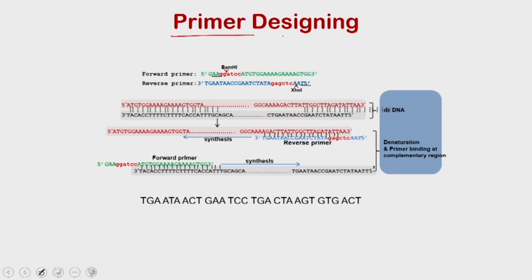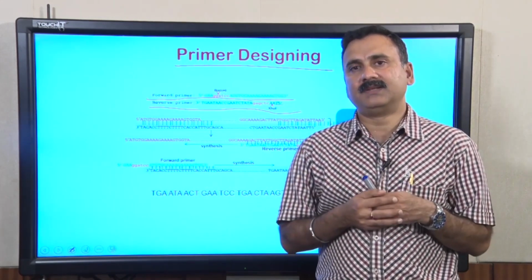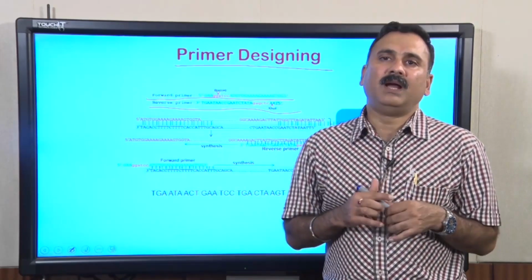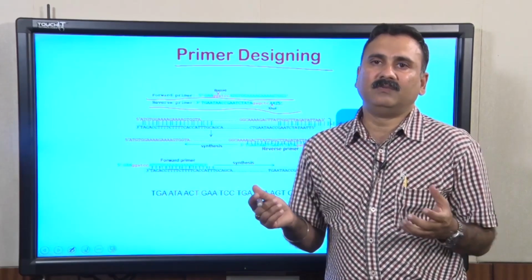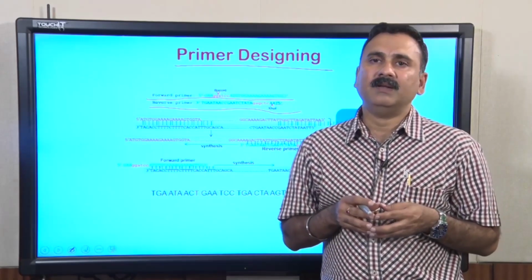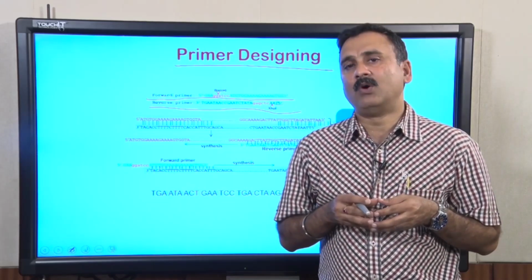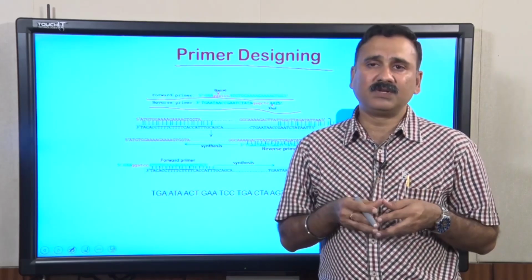We have also discussed primer designing, both designing the forward primers and the reverse primers. We have taken you to our laboratory, where my student Swayam Prabha has prepared a small movie. With the help of softwares, he is going to show you how to design the oligoprimers or oligonucleotides, and how to analyze them using the software under different parameters.